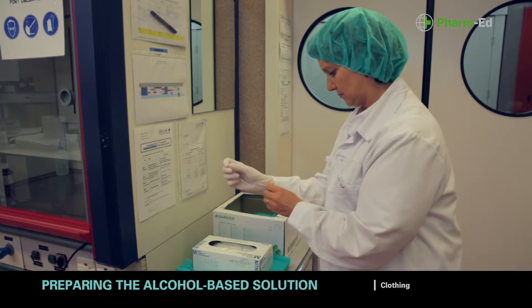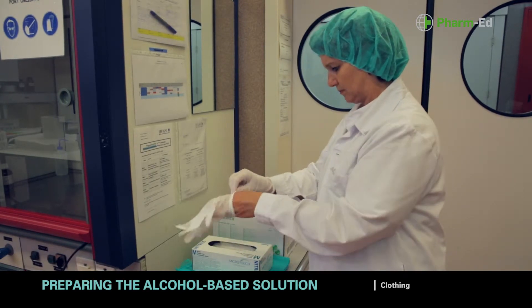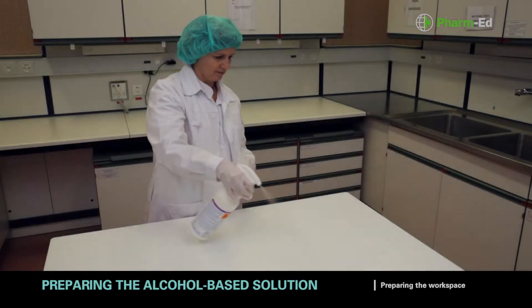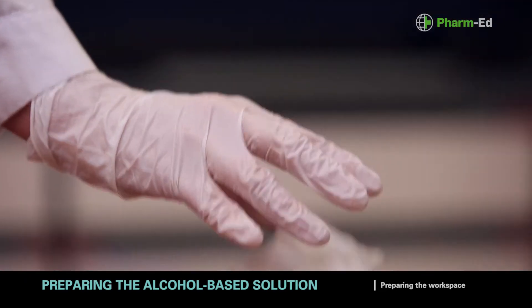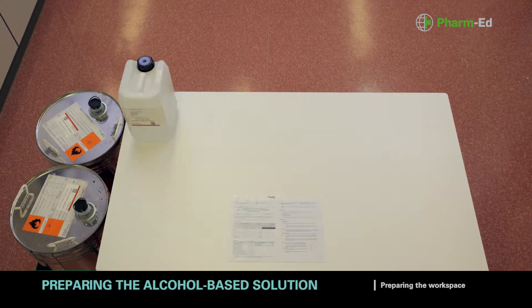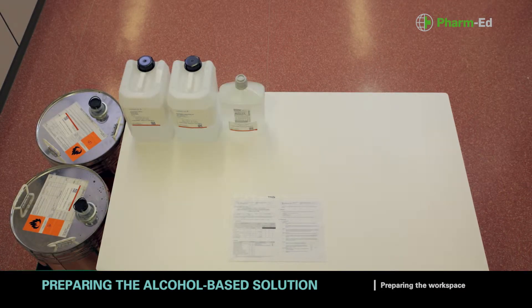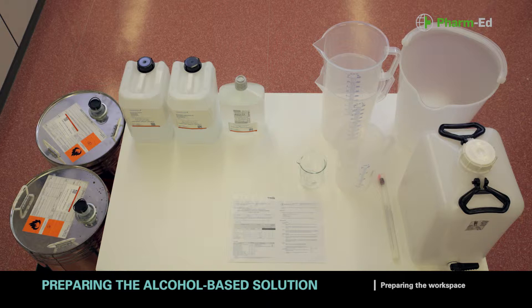It is essential to work in an ordered, methodical and tidy way before, during and after production. Before starting to prepare the solution, check that the factory line is clear. Specifically, you should make sure that the workspace is clear of any unnecessary raw materials or equipment. Then clean it carefully using alcohol. Set out the workspace with the necessary amounts of the ingredients for production and all the equipment, and check that it's clean.